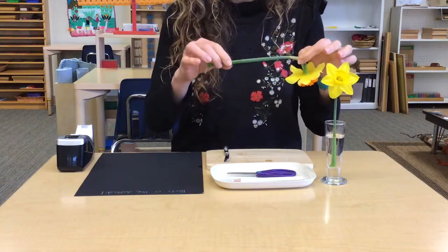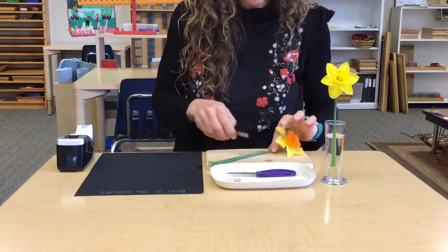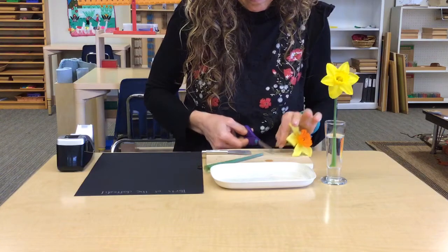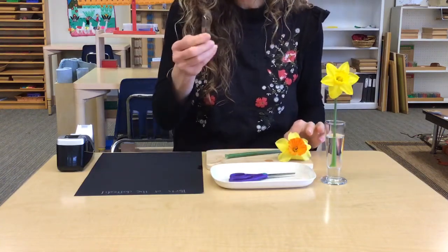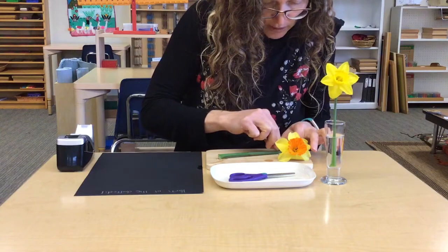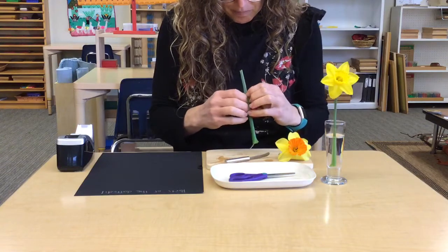And start by removing the stem below the spathe. It's got some water in it. It's good, nice and healthy. Actually, the scissors probably will work better for that part. And you can use a sort of cheese spreader or a butter spreader. If you just push a little, it will cut right into the stem and open it up right down the middle. Don't push too hard or it'll cut all the way through.